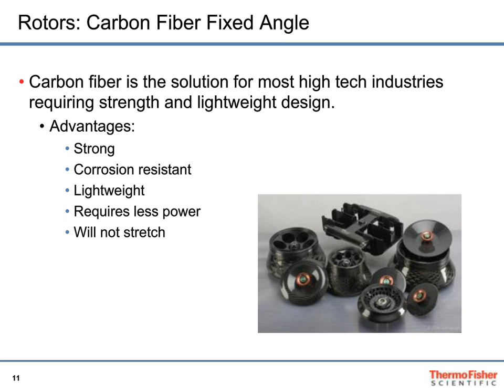Metal rotors also have another dynamic to them. We've pushed the performance of these centrifuges so much in these last years that we're pushing these metals so that, it seems counterintuitive a little bit, but they do actually change shape a little bit at speed. And basically what that's doing is giving the most performance capable we can possibly put into the centrifuge in a metal rotor. But of course, on the other hand, that's giving it a fatigue life. It will fatigue over time.